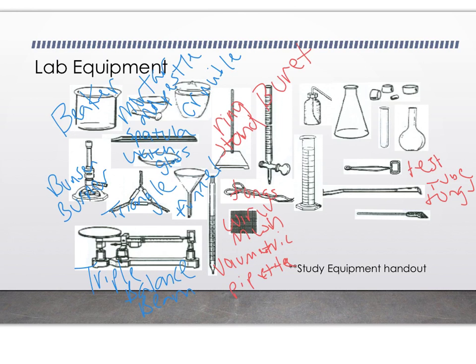Then we have our graduated cylinder. The graduated cylinder, this is used to measure different amounts of your liquid. There's different sizes of graduated cylinders, so make sure you choose the appropriate one before you start measuring out your liquid.